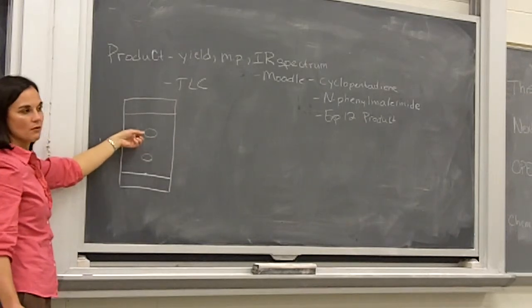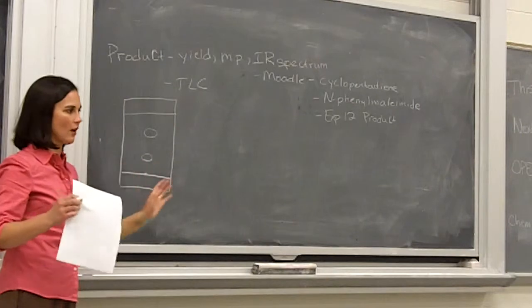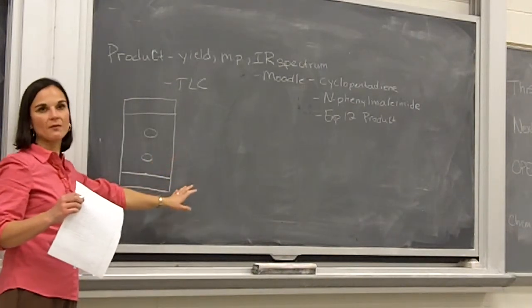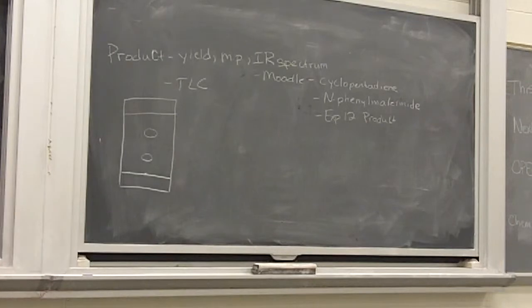much to the silica. So if you remember from Gen Chem, thinking of like dissolves like, and like wants to hang out with like, more polar things like the silica, they want to hang out with the silica, and less polar things won't hang out as much with the silica, okay? Now the other thing to keep in mind is that silica is very polar.